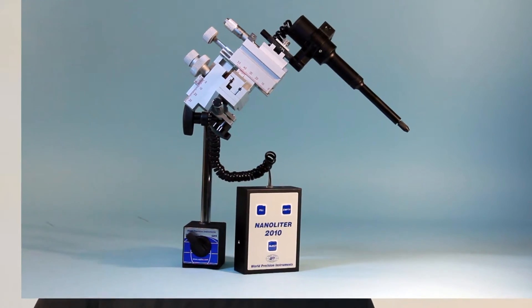Hi, I'm Tammy Jo with another WPI technique. Today we're going to talk about our Nanoliter 2010 microinjection system that is widely used in zebrafish applications.